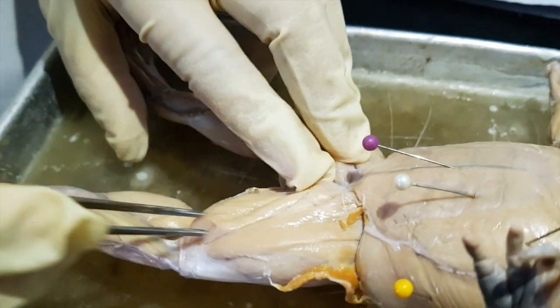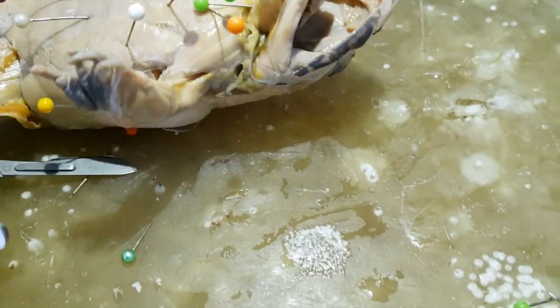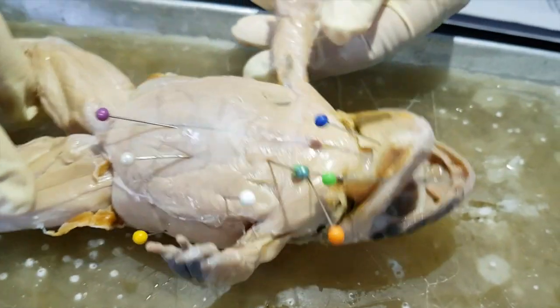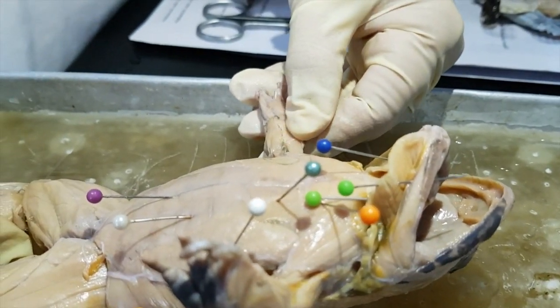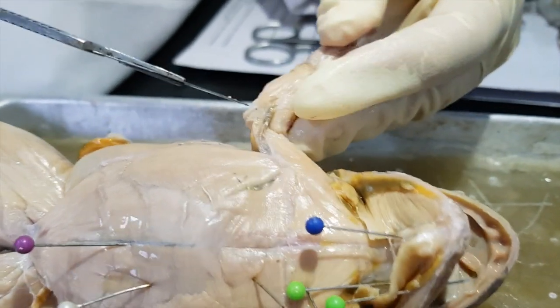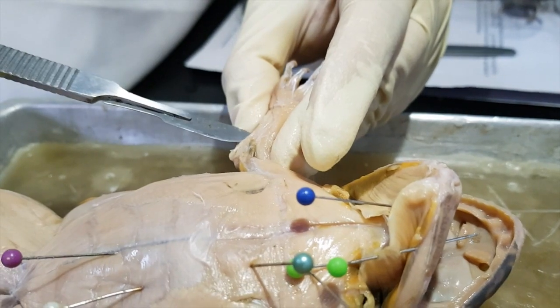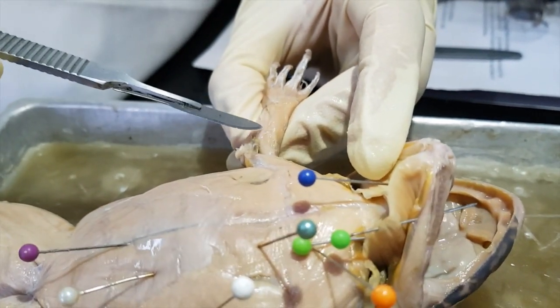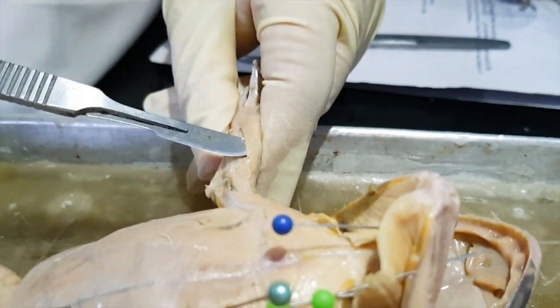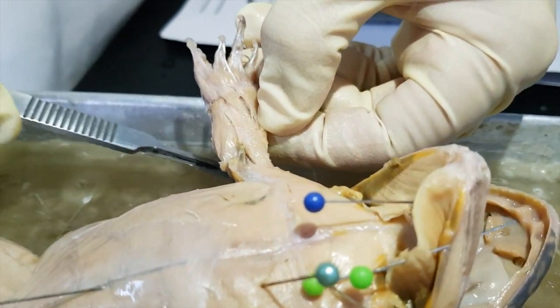Okay, then we move on first to the arms. So the dorsal side is the extensor group, and the ventral side is the flexor group of muscles. So the same basis, the elbow. Okay, so that's the ulna side. So this is the flexor carpi ulnaris and the flexor carpi radialis. Okay, seen here is this very small muscle, which is actually an extensor carpi radialis.